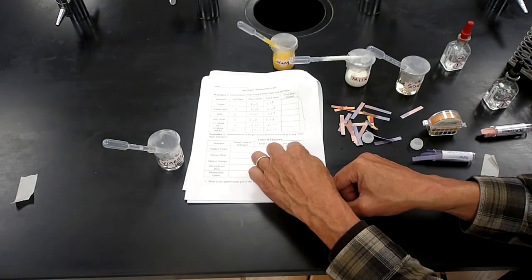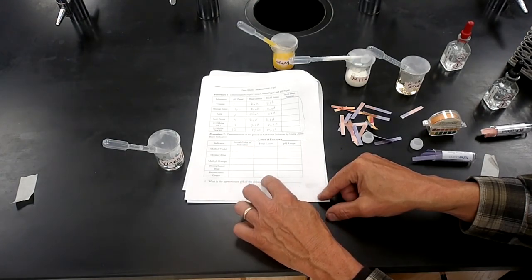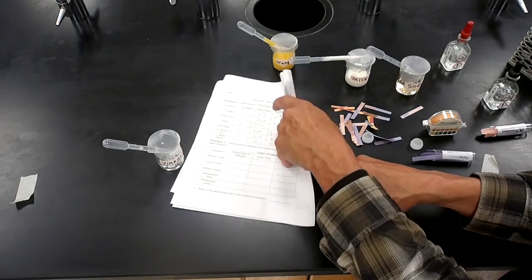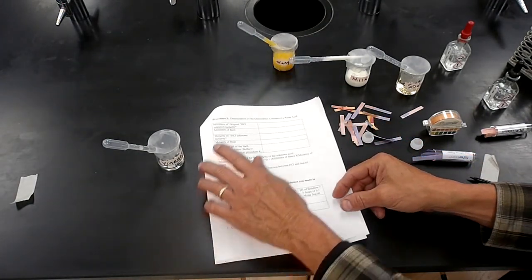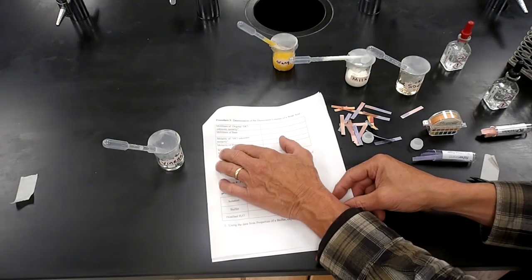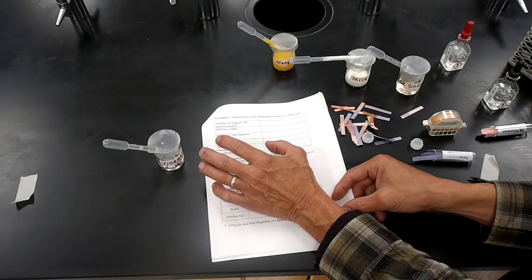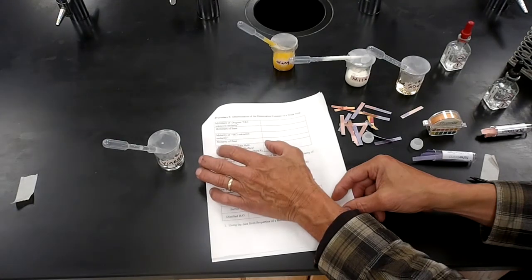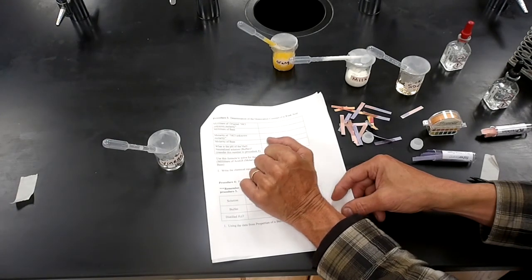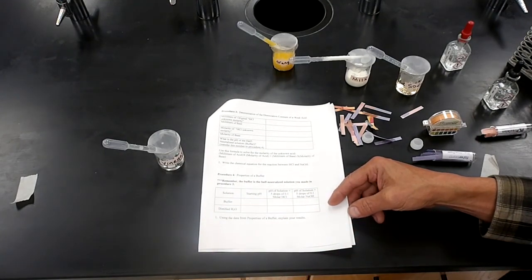I may give you the first pH range for one of these, and then let you fill out the others based on the color in that previous chart. That'll be procedure 2. And then the last one we'll do is a little more complicated and much more accurate. Procedure 3 will be a titration. That allows us to calculate the molar concentration of an unknown solution, and it's really pretty accurate. It's a good technique to use. I'll show you how it works. A lot of our automated machinery uses titrations to figure out concentrations of unknowns. So I'll add this to the video next. Take care.